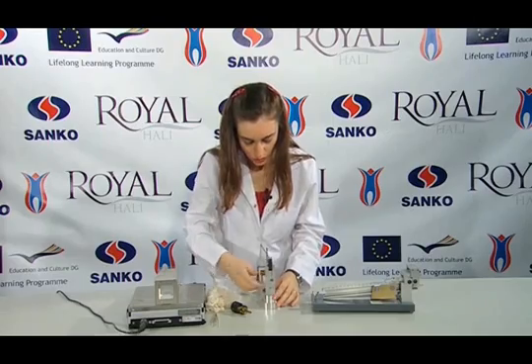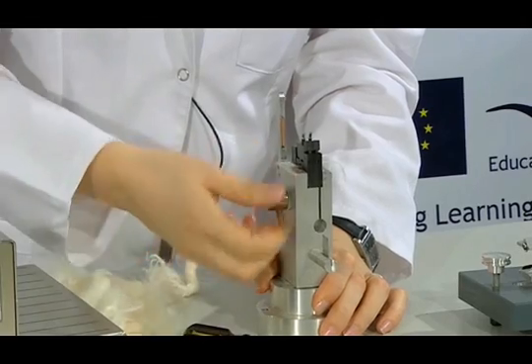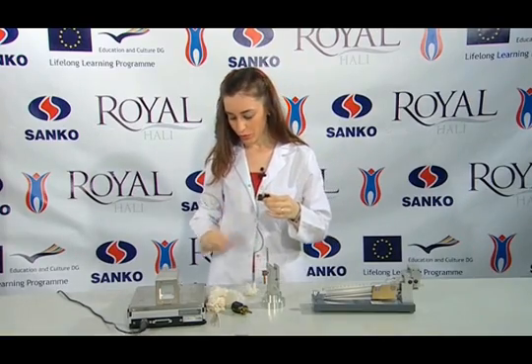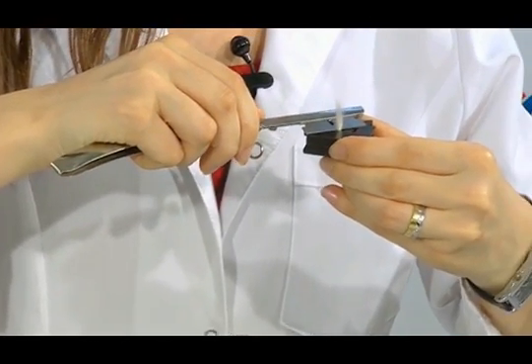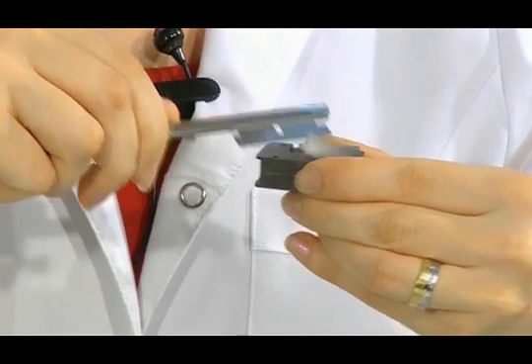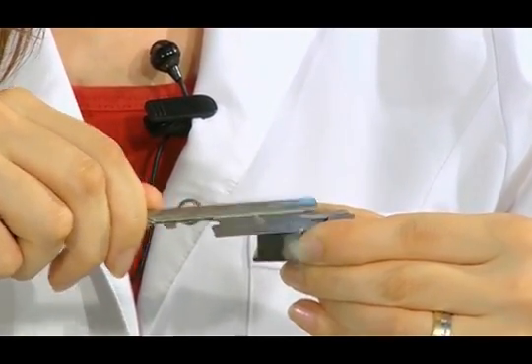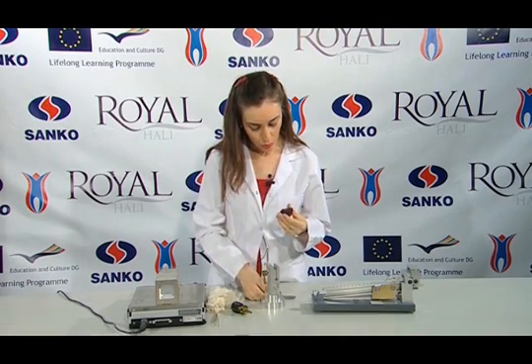Now we are raising the handle and we loosen this part. We are taking out the nippers slowly. By the help of a special knife or razor blade, we hold it so that it can be cut from the zero point.